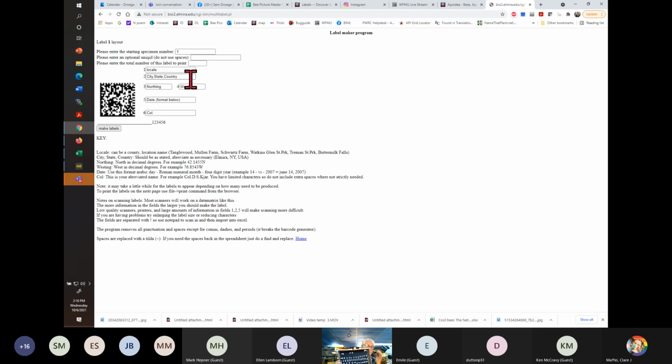That way the person who is scanning, because we scan in these numbers, is less likely to accidentally pick up an adjacent specimen number in their scanning, which is problematic. Unless you're at the beginning, you're not aware of that, and you can merely be scanning things in, but some will be scanned in twice and some not at all if you're sloppy and you put all your specimens close together.